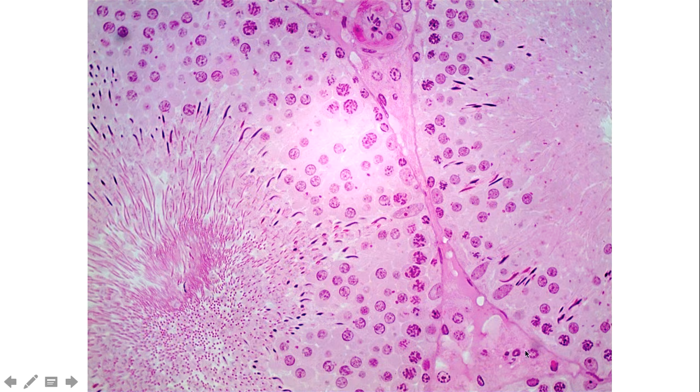Then the third cell type that you're expected to be able to identify within the testis slide would be the interstitial cells. And so the space here outside or between the tubules, this is where you're going to find the interstitial cells. And these are these cells here that have the nice granular cytoplasm with very prominent nuclei. These interstitial cells are the ones that produce testosterone. They're producing the sex hormones.